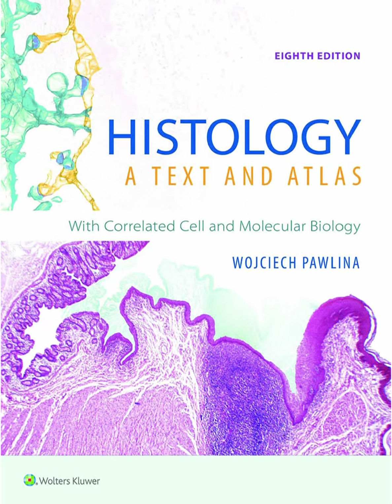Definitely. Then there's another classic technique called autoradiography. Autoradiography sounds like self-pictures with radiation. Sort of. It's like creating a molecular treasure map using radioactivity. Scientists introduce precursors like amino acids or nucleotides that have been tagged with a radioactive isotope. Okay, radioactive building blocks. Exactly.